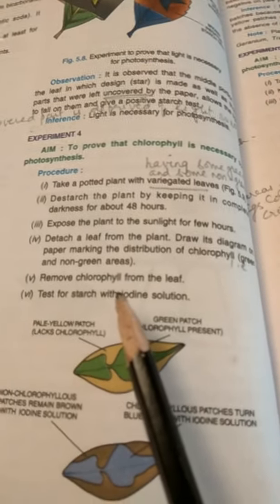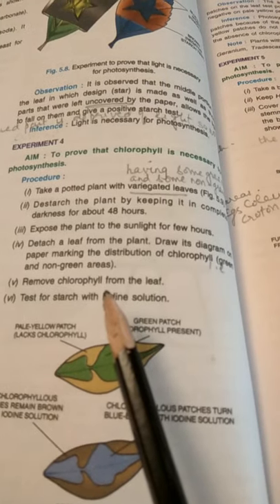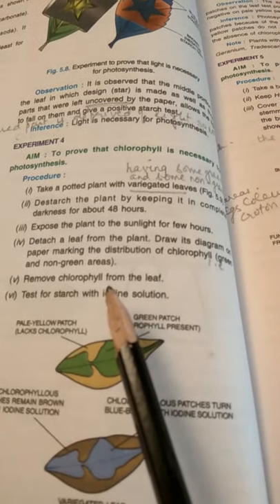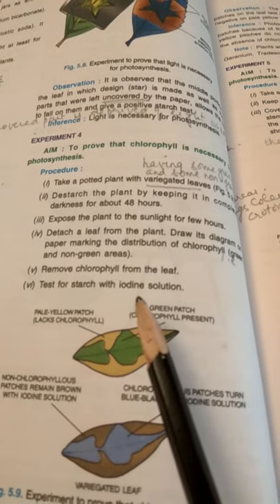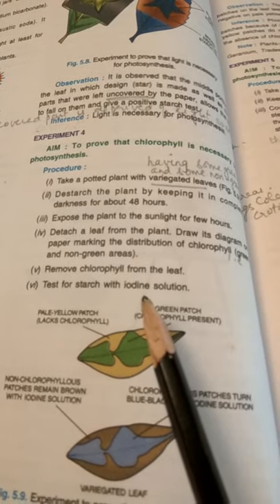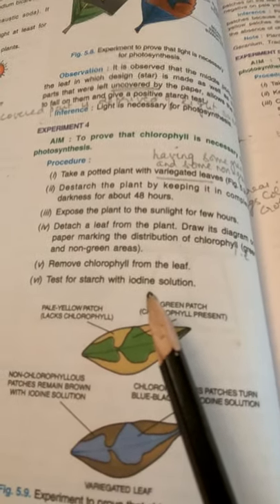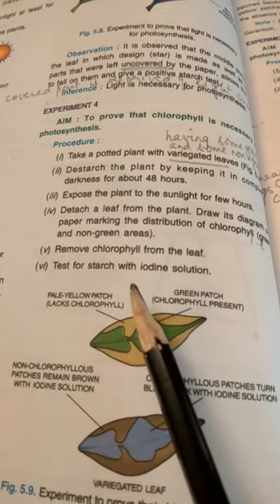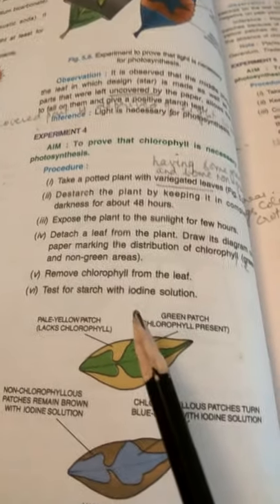Now we will put this leaf through a starch test. We'll boil it in hot water to kill the cells, then boil it in methylated spirit or alcohol to remove chlorophyll, then put it in hot water to soften it. Then we will take out the leaf, place it on a dish, and test it for starch using iodine solution.